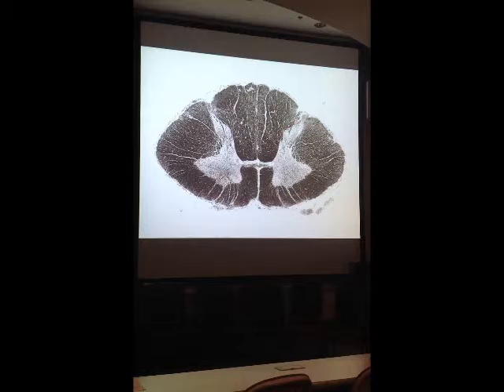You can see in the dorsal horn, I think you can roughly see it, the dorsal horn looks to be capping out, ending right about here. On this side, ending right about here. So lamina 1 is out at the tip of the dorsal horn, and next to it should be lamina 2, which is not all that obvious on this slide. So lamina 2 is right in this region. Lamina 2 on this side is right in this region.